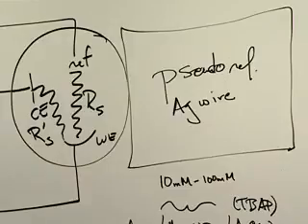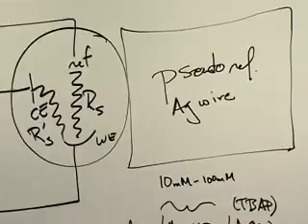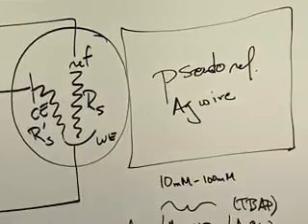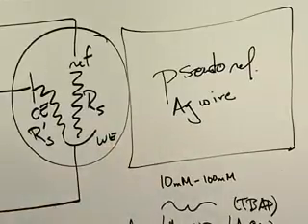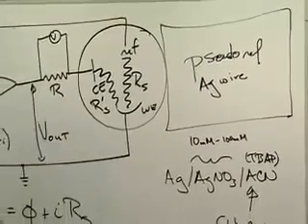You'll end up with silver chloride coating it. At some point, you'll get to this electrode, but it's going to take some time, so you will have no idea. You'll have a constantly shifting reference potential now. In the case where you have something reactive, if you're doing a very, very fast experiment, you often can get away with just a platinum wire as your reference electrode.